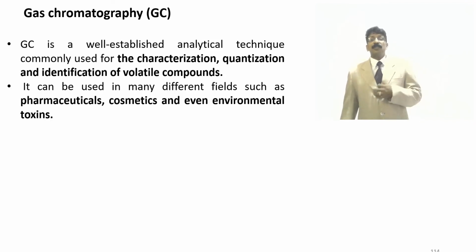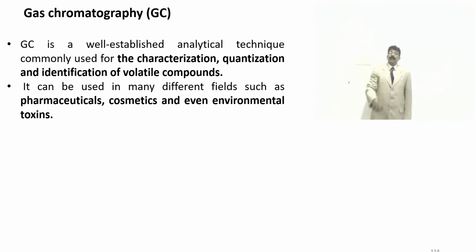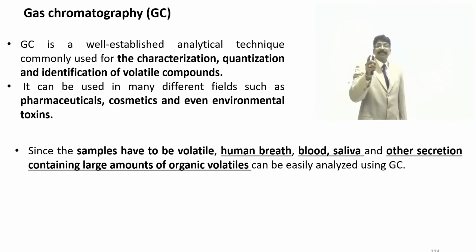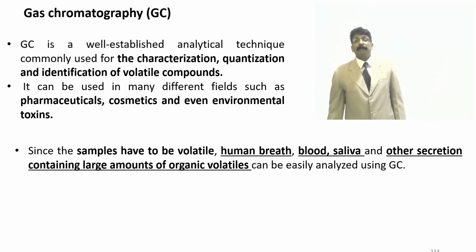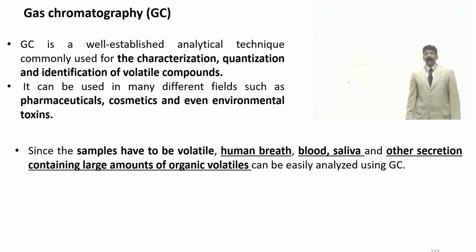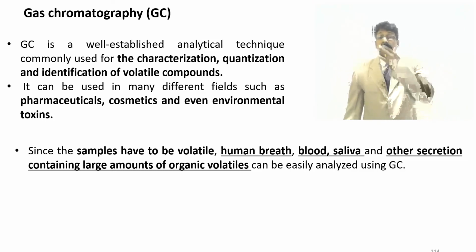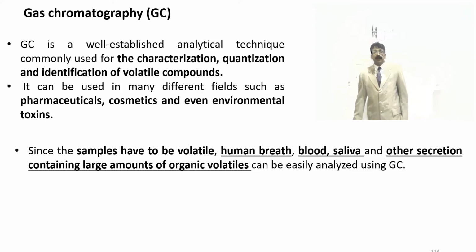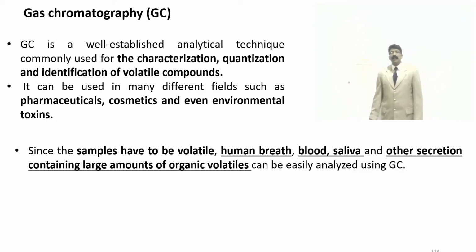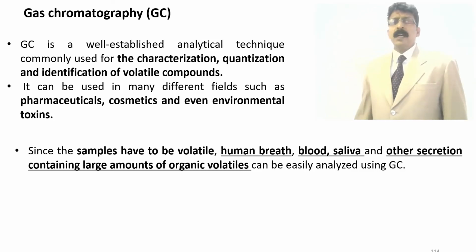It can be used in different fields such as pharmaceutical, cosmetics, and even environmental toxics studies. Since the sample has to be volatile, human breath, blood, and saliva can be analyzed by gas chromatography, and other secretions from our body containing large amounts of organic volatiles can be easily analyzed. So it has a lot of laboratory applications.